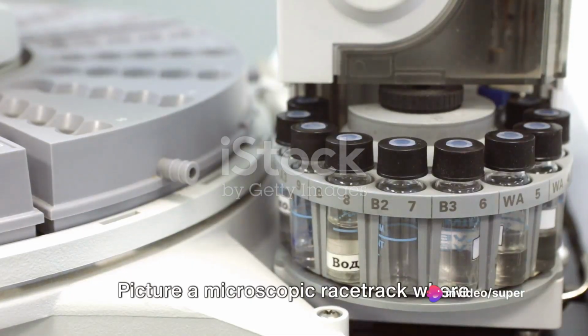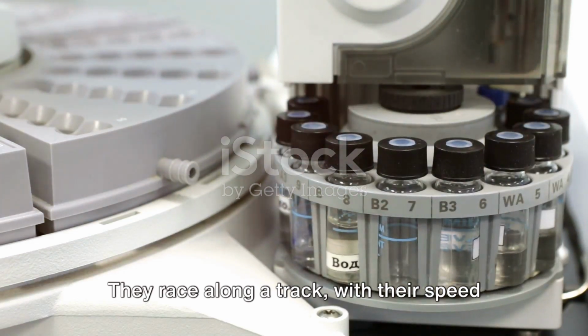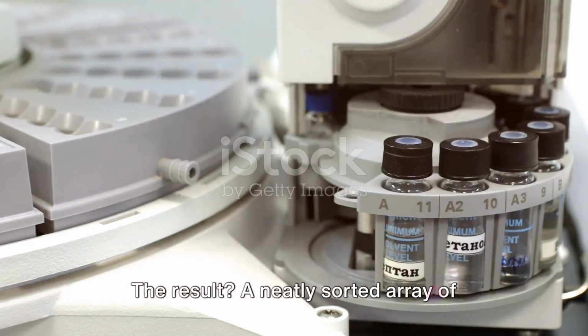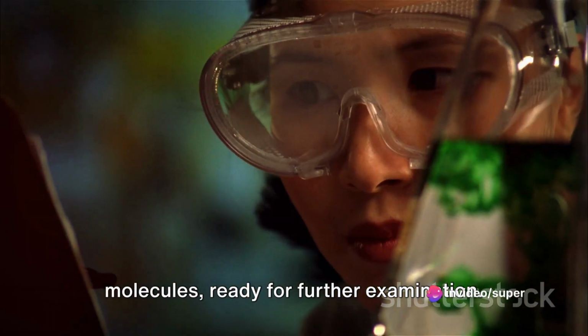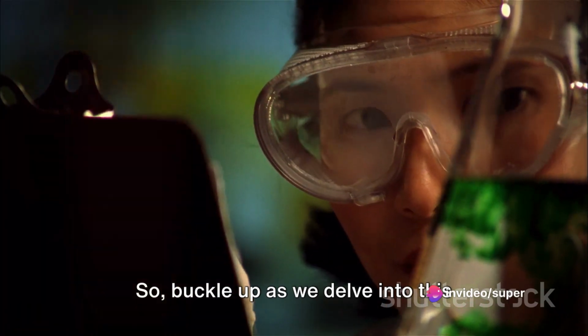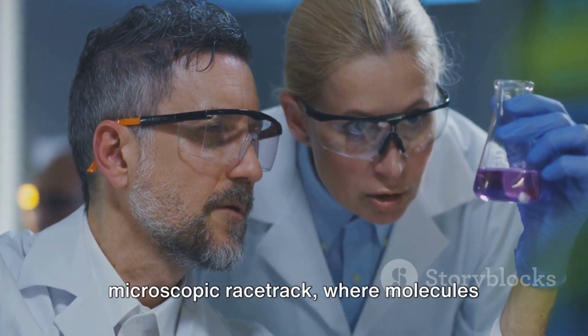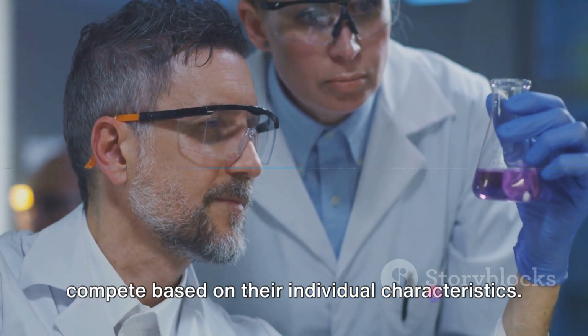Picture a microscopic racetrack where each molecule is a competitor. They race along a track with their speed and path determined by their individual characteristics. The result? A neatly sorted array of molecules ready for further examination. So buckle up as we delve into this fascinating realm and think of it as a microscopic racetrack where molecules compete based on their individual characteristics.